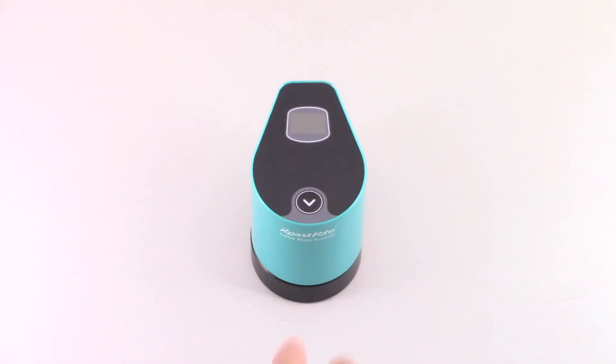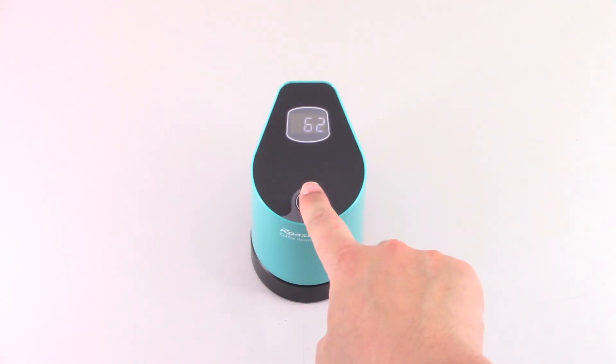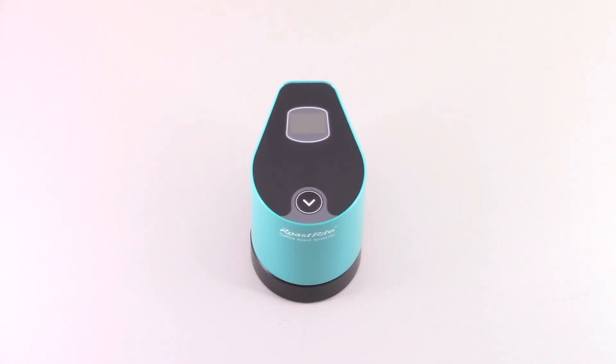Press the button once to show the last measurement, then press again to start a new measurement. The result will be displayed on screen in a few seconds.